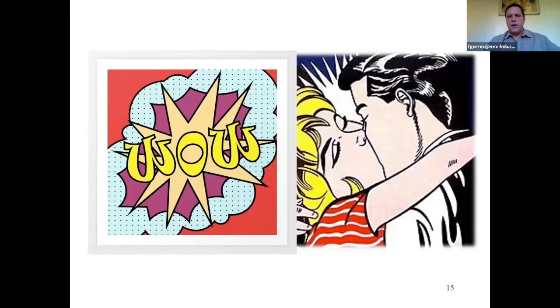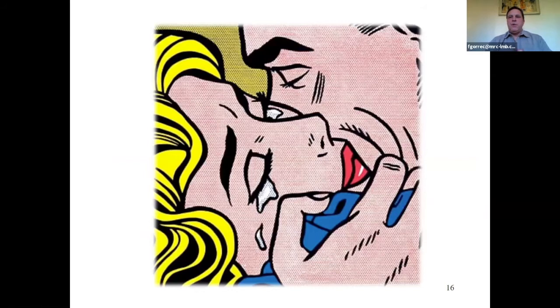You may be so excited that you grab your assistants, and then there's hope. You're kissing, it's extraordinary. You may buy a house in Cambridge with this successful project. Unfortunately, when you put it in the X-ray beam, it doesn't diffract, so that's very disappointing. But it's a scenario that can happen, unfortunately.